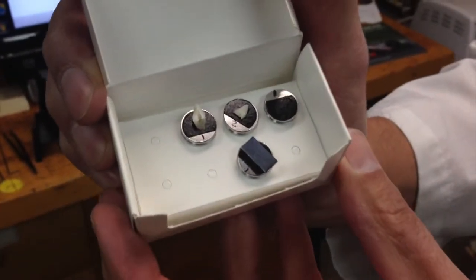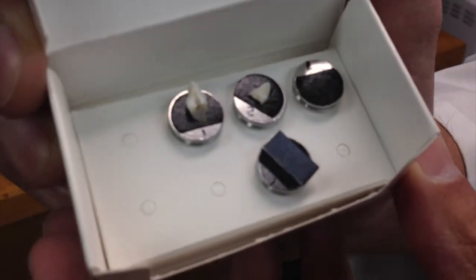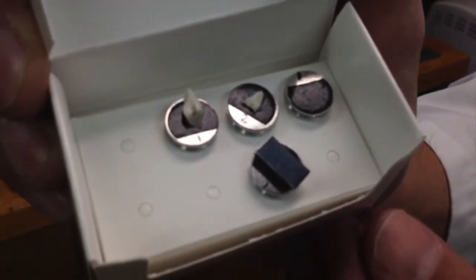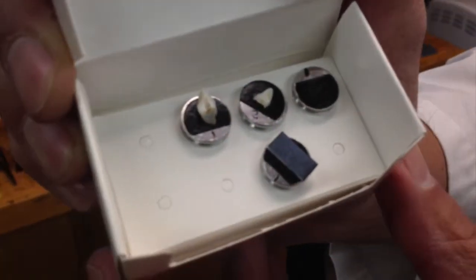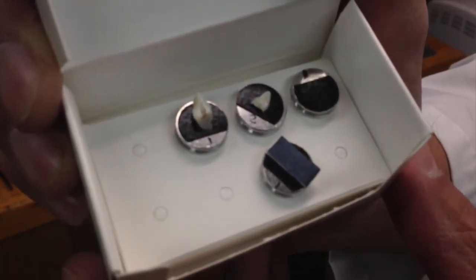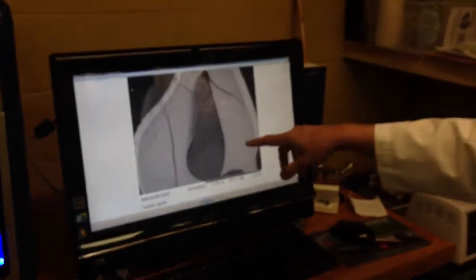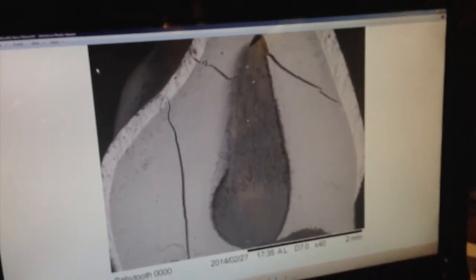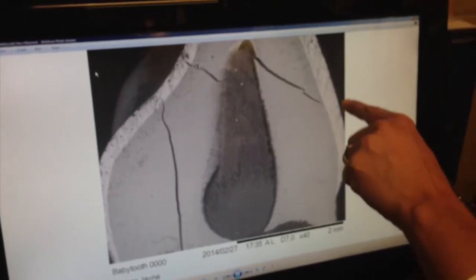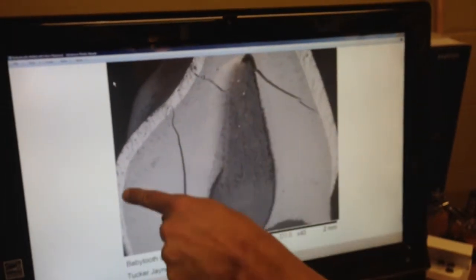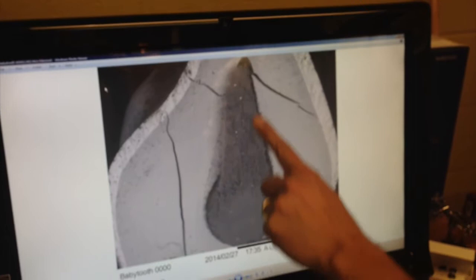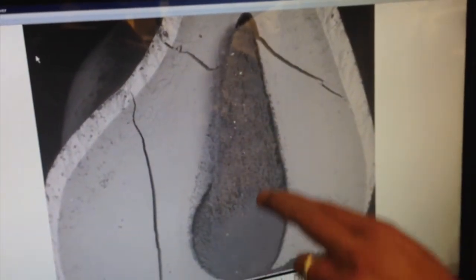What if we were to use the scanning electron microscope to analyze what the inside of a baby tooth looks like? To the left here, this is the inside of a tooth — we decided to analyze it on the microscope. Here you can see the tooth with the inside broken away so we can see the whole interior. Did you ever hear of enamel? That's the stuff you want to protect — it's the white border edge on the outside of the tooth. If you've ever felt cold pain when you chew on something cold, these are the nerves and bundles inside called pulp that actually sense that.